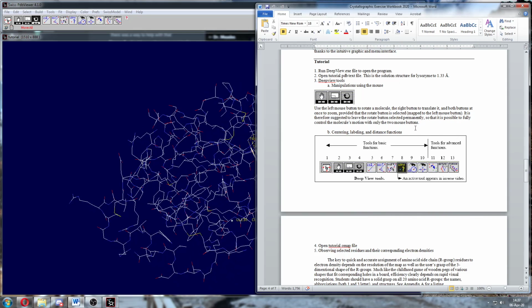And so that's all your basic functions right there. Do you guys have any questions on those first before we move on to the next part? Is there any of those you have concern of UCSF Chimera being unable to do so? I think the Chimera program has similar functions, but I'm sure the buttons look a lot different.